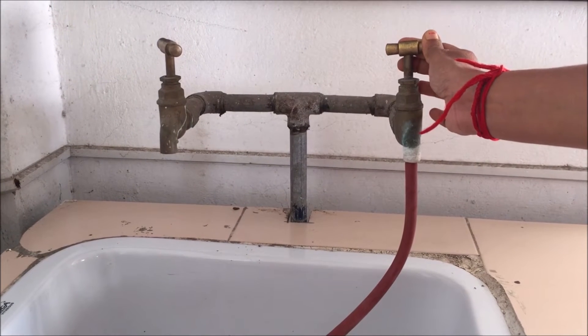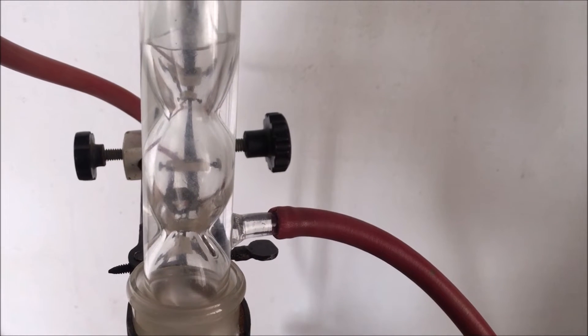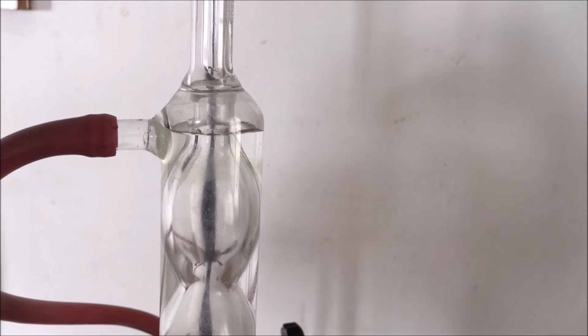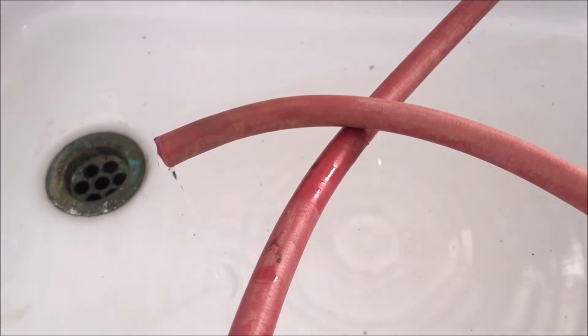Now turn on the water supply. Through the inlet, water gradually rises up to the top of the condenser, and when the condenser is completely filled with water the water comes out from the condenser through the outlet pipe. This is the water coming out from the outlet pipe, placed inside the basin.